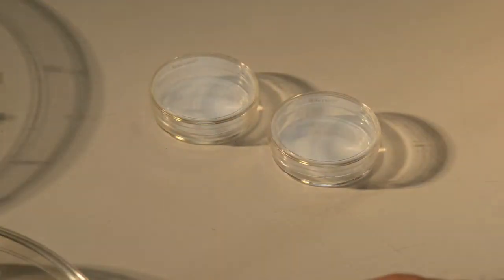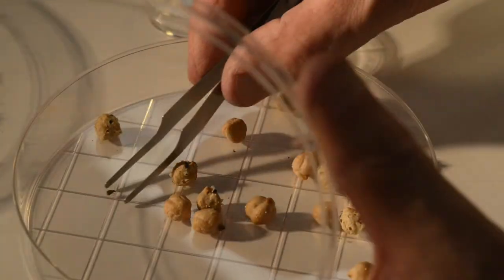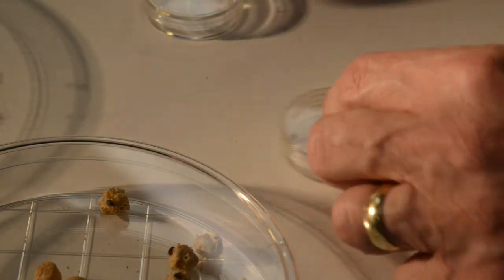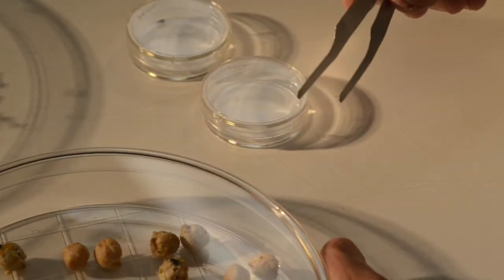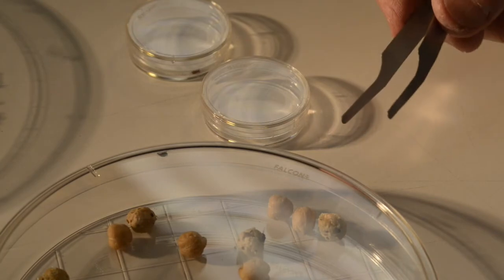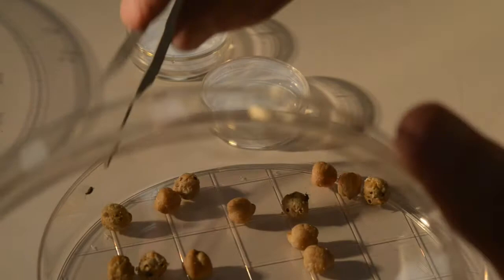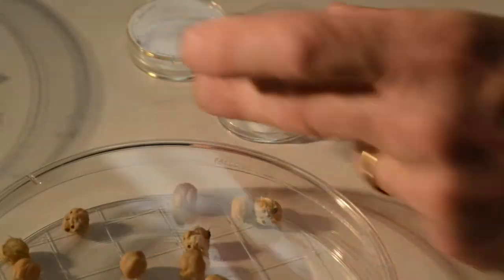Generally, I try to isolate beetles in very small containers — these are 35mm dishes. Tap the dish down to get the beetles down, and then just go in with soft forceps and pick out the beetle you want. I just picked out a male, and now I'm going in to pick out a female. These soft forceps aren't required, but they do make it a little bit easier to handle beetles without the risk of crushing one accidentally.